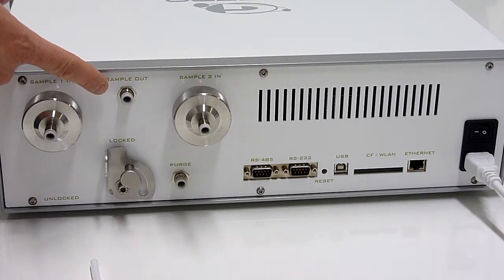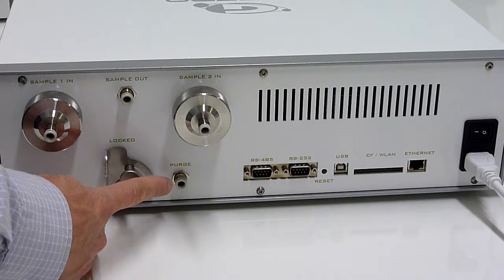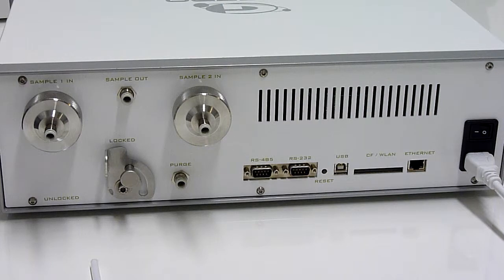For outgoing gas, there is an additional gas connector, non-filtered, and the instrument — which has a pump inside — exhales the gas through this connector. The fourth gas connector is for purging. You can use nitrogen or other inert gas to flush the interior of the cabinet for sensitive measurements.